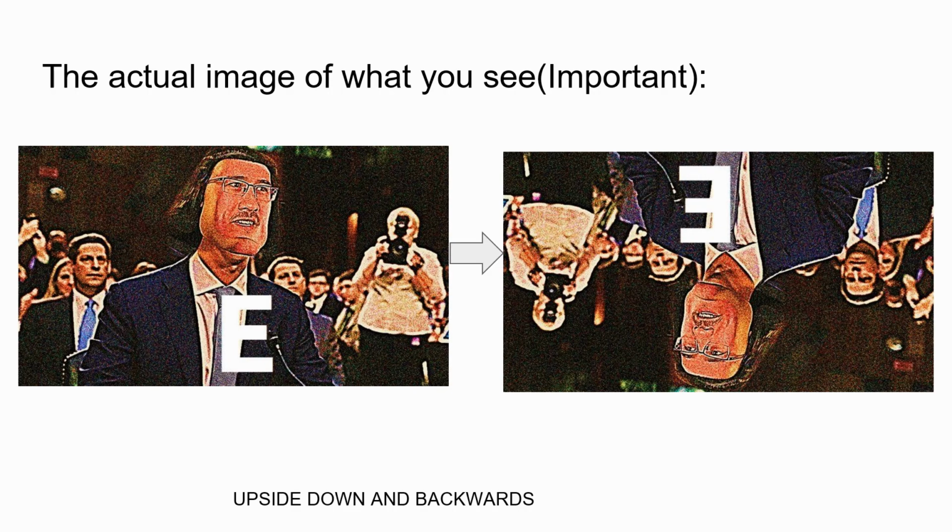So during exams, there will be multiple choice questions that ask you what is the actual image of the specimen and what you would see through the microscope. So a good lab skill, a good exam tip, is to flip the paper 180 degrees to see how the image is seen through the microscope. So upside down and backwards. Always remember this, so you can see the Markiplier thing. You just flip it around and then you'll see what you'll see through the microscope.